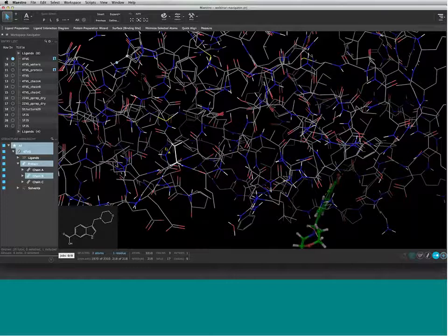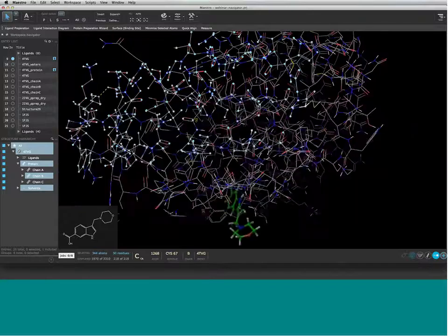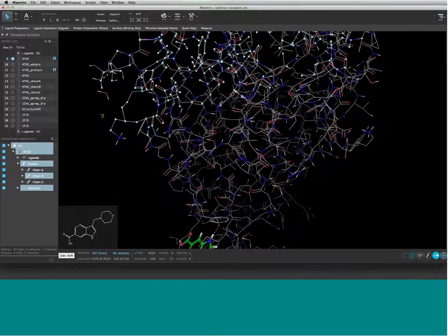Okay, another thing I wanted to go over is clearing selection. Let me step back. Everyone knows you can do a marquee like that to select atoms, right? And if you shift with the marquee, you're adding to your selection. But here's a trick: how do you remove from your selection? Obviously, you can control marquee, but since control is actually doing a toggle, you could end up accidentally reselecting what you just tried to deselect, like I just did here. And you see it's not really working.